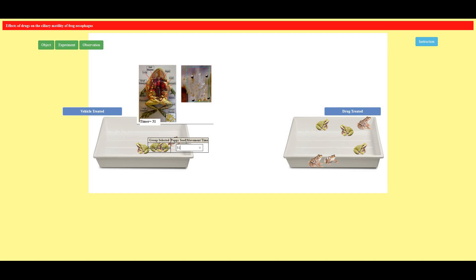So for a vehicle treated frog I have seen that it is taking 30 seconds or 31 seconds of time to reach the caudal point.